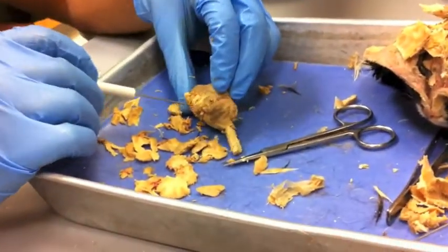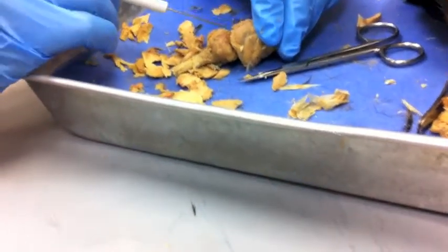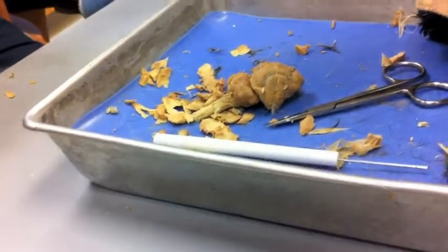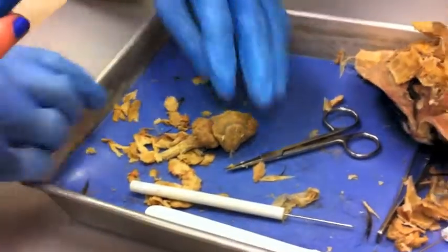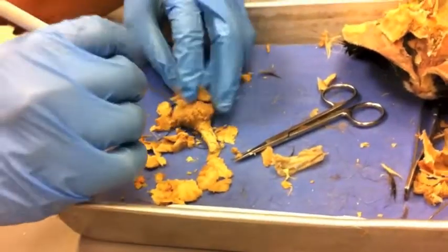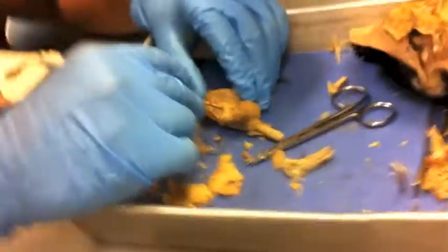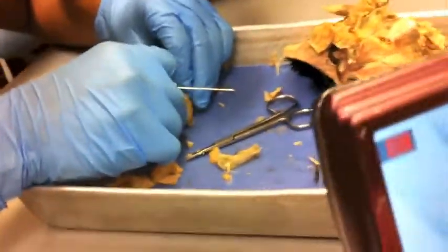So this looks like just the left part of the hippocampus. Whoa. The left and the right are connected. That's why they call it hippocampus, a ram's horn, because it comes like that. That is so awesome. If we do it on Thursday, I'll have the brain ready for you guys. I'll take an hour before, have the brain, and then I'll dissect the whole hippocampus. If you looked at that under the microscope or took a section of it on a slide, what would it look like?